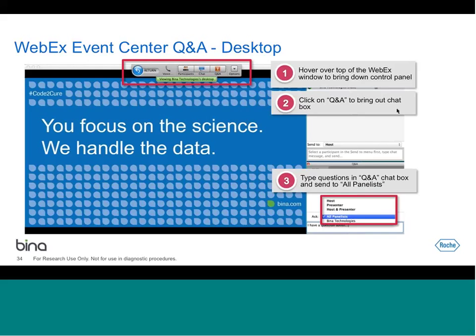Okay, another question. Can SomaticSeq be applied for detection of other types of mutations, such as somatic structural variants? We are currently developing ways to detect somatic structural variants. Some of the features in SomaticSeq, so far it works for SNVs and indels. Some of the features may also be useful for structural variants. Some of them may not be, so it's currently under development right now.